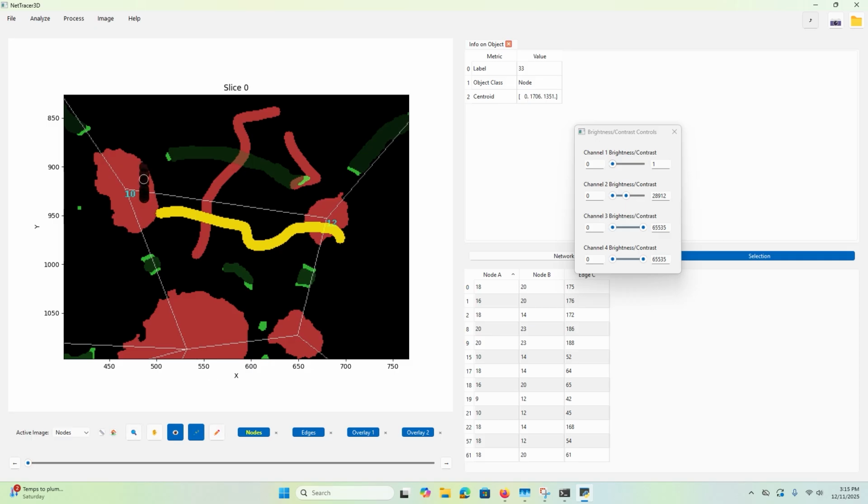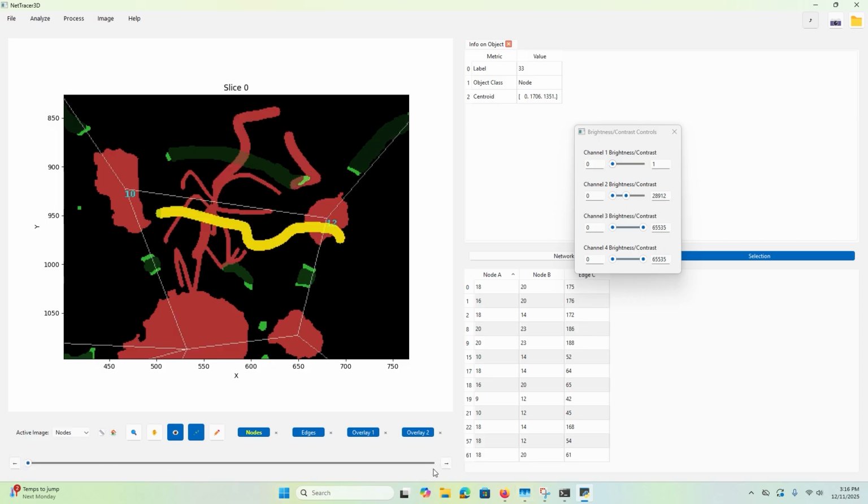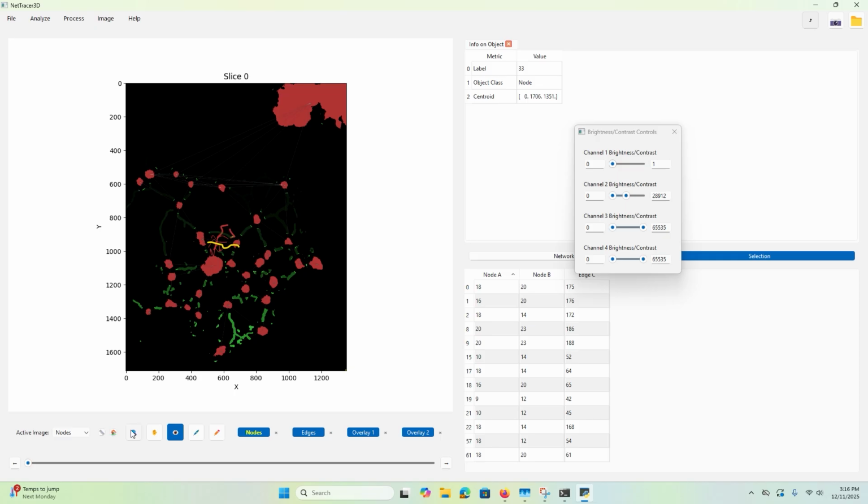Similarly, when you're using this, you can erase stuff with the right click, control mouse wheel to resize it. It also has a fill can if you press F, and if you press D, you can write into multiple Z-planes at once if you want to, if you're trying to fix something that's deep in 3D. And then looking down here again, go left and right. This moves you through the Z stack. This image is only 2 slices thick, so we're not really going to have much to work with there for this case.